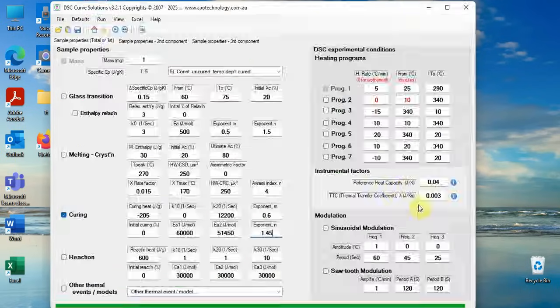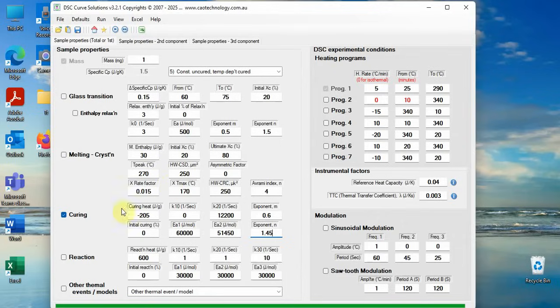That is all what we want to know, no more and no less for non-isothermal kinetics of the resin.